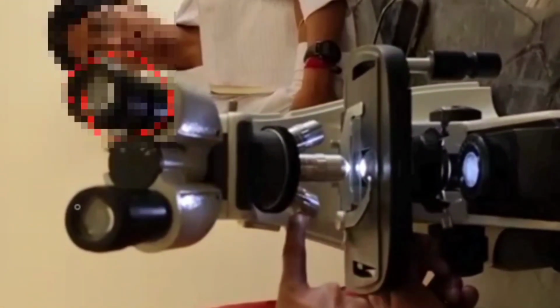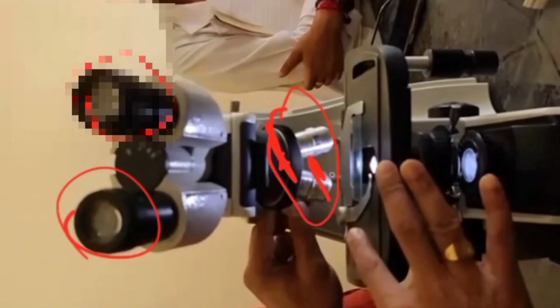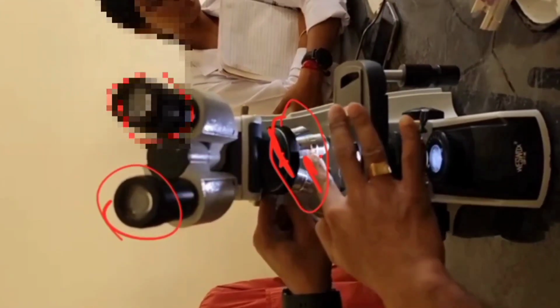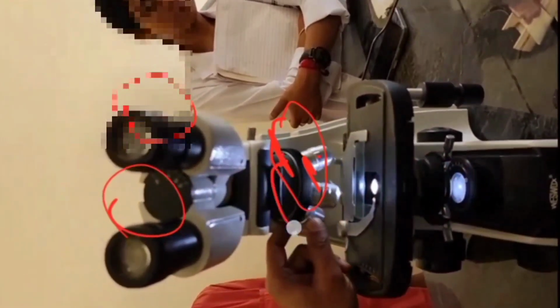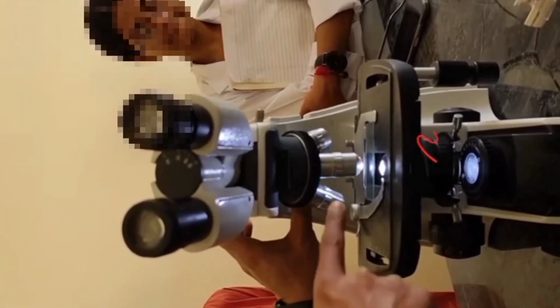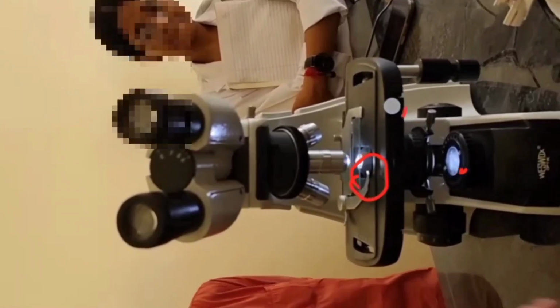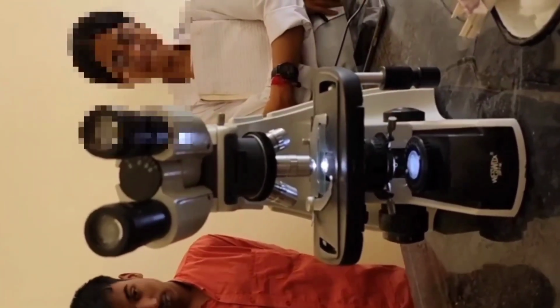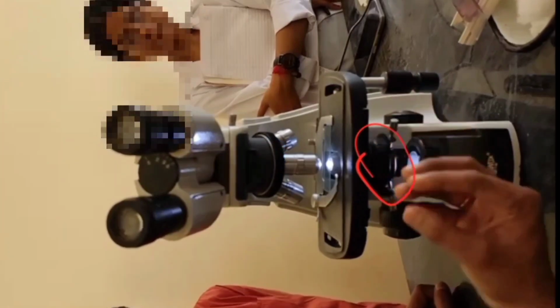And this is the eyepiece, and this is the nose piece, and these are the objective lenses: 4x, 10x, 40x and 100x, we have four objective lenses. And these all are arranged in a parafocal arrangement. Here the light is passing through this aperture, the open area in the stage, and that light is controlled by the diaphragm and condenser.